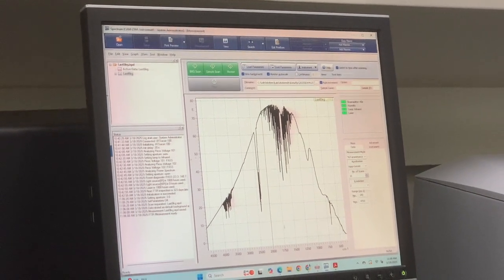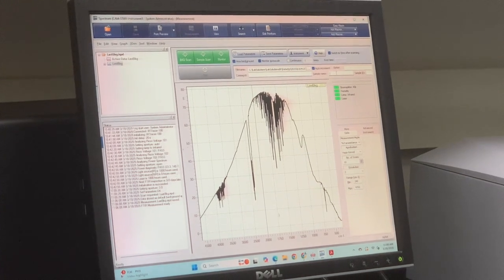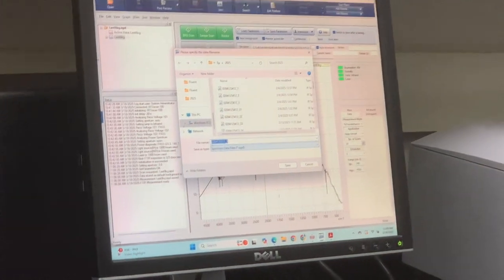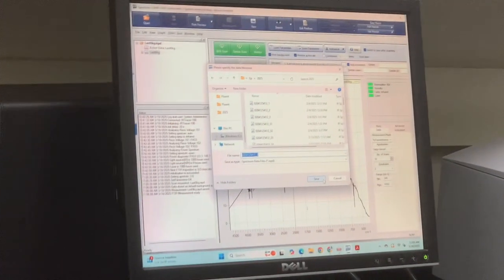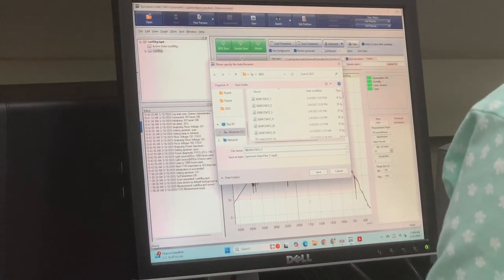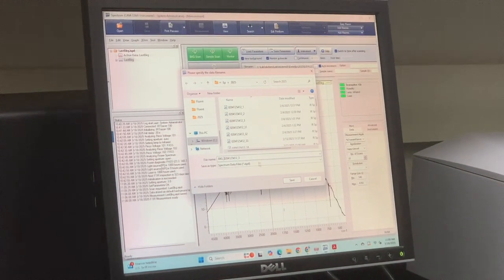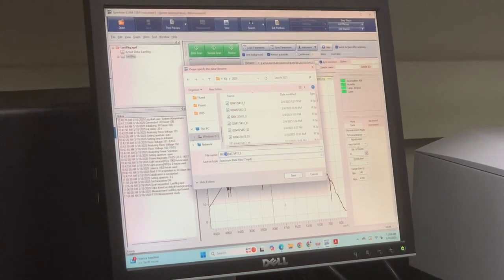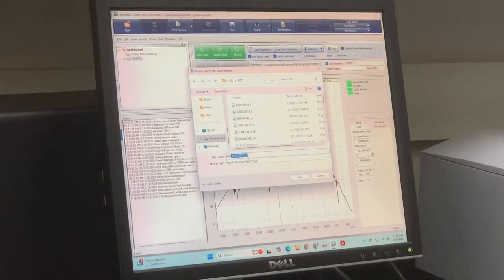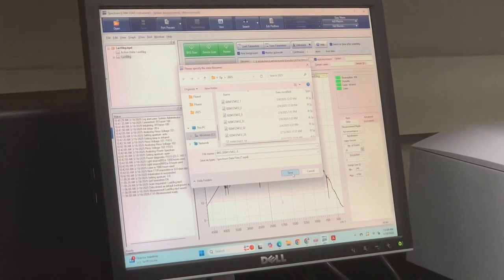Okay. Do you want to name this sample anything specific? Just background scan. File name. See if we have an auto file name. Yeah, we'll just do test background or something. Just a bunch of numbers. It's probably a date or timestamp somewhere in there. All right.